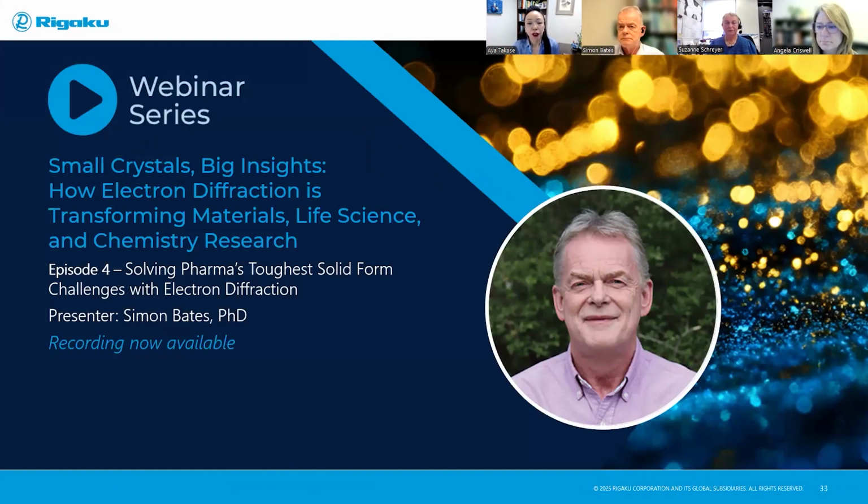And we covered single crystal, thermal analysis, powder XRD, EDXRF, CT, and handheld Raman analysis techniques in this webinar series. And this one will conclude the series.